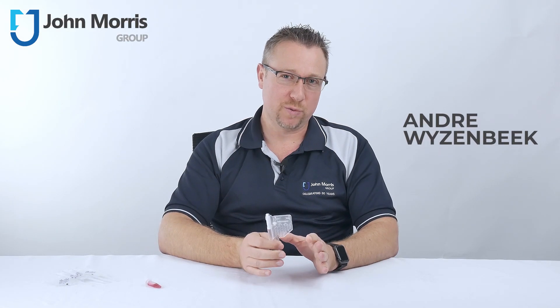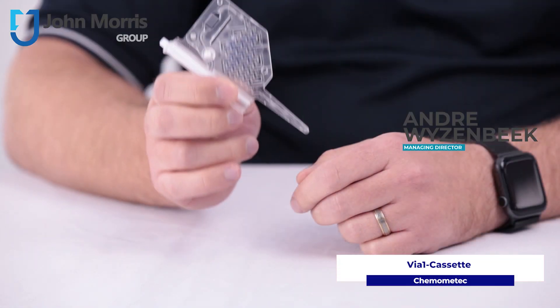Hi, my name is Andre from the John Morris Group, and today we're looking at the Via1 cassette from ChemoMetec.